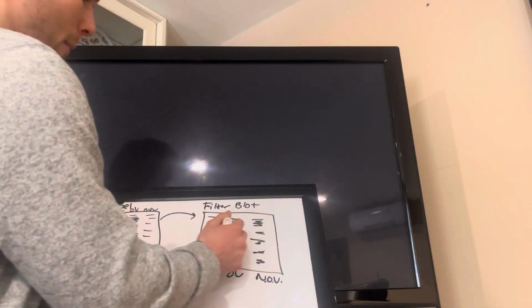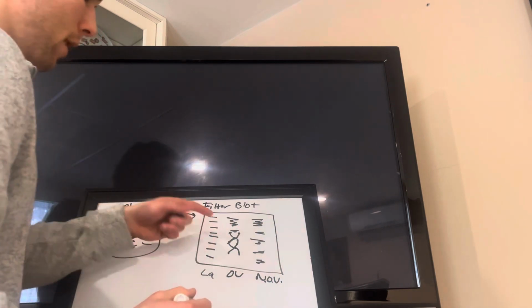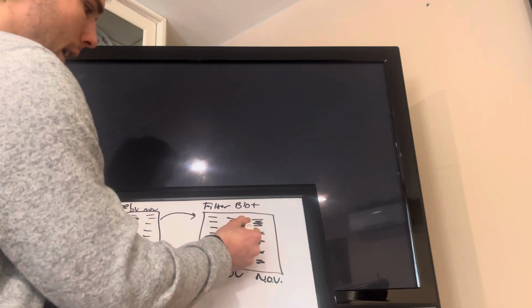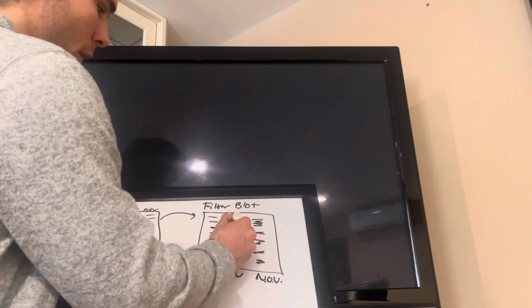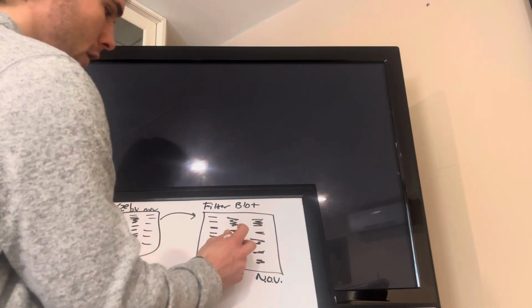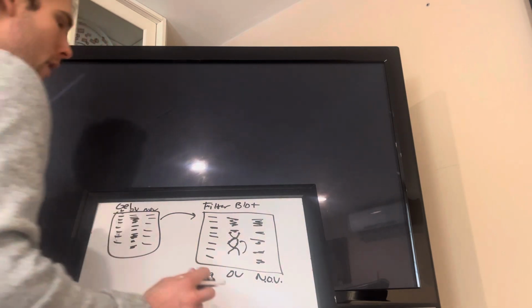Again, this is just made up, we're just imagining that this area is where P53 runs on the gel because we know the molecular weight of P53 and it's around whatever this is. But really what we're trying to imagine here is just seeing how the primary antibody binds to the P53 protein, and the secondary antibody will bind to the primary antibody.